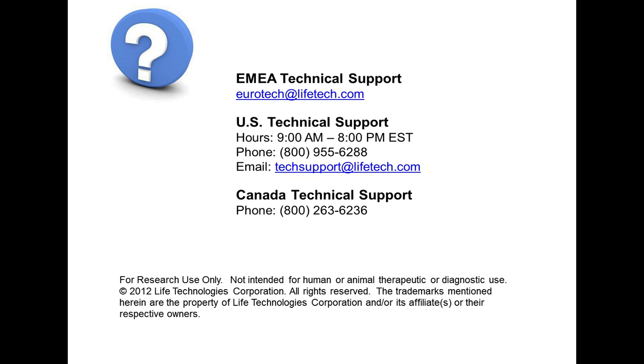There is a question about how small of a particle size a flow cytometer can measure. This is a really interesting question, and there is no real answer to that. It's going to depend on the specific optics and fluidics of a particular instrument. I would say that most cytometers can get down to a particle size of around 1 micron. Some can go lower, but you have to be very careful in distinguishing the actual particle from the background debris. This is where, if your small particle is fluorescently labeled, it really helps to distinguish that from background and debris.